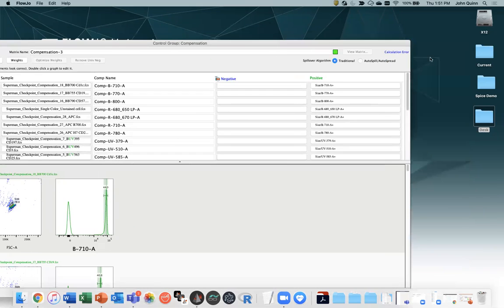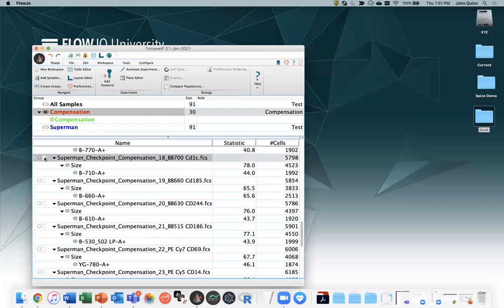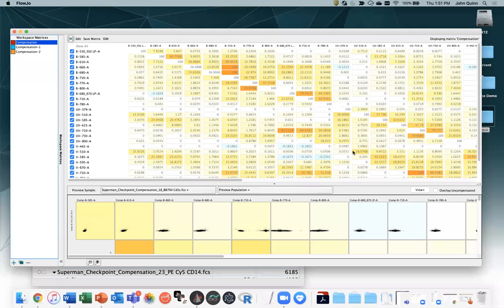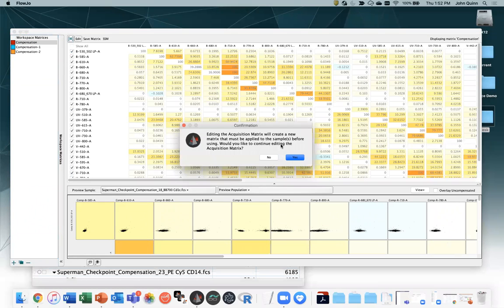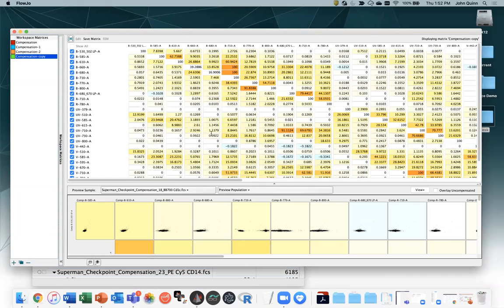And so when you are looking at a matrix, and I've futzed with that one, so let's go back to a finished matrix. You'll have all these numbers and they're grayed out to begin with. You have the option to edit. You'll get this warning message that says effectively, don't do this. If I say yes, we make a copy of the matrix, the numbers ungray, and you could start going up a little bit by hitting the up arrow, going down a little bit, typing a number. If I hit enter, that applies that change.